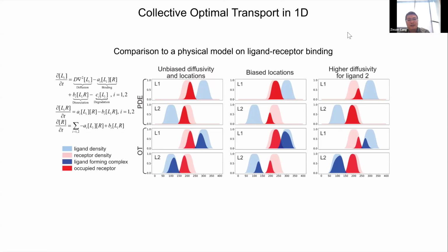In that case, a straightforward way is to use whatever decomposition methods that are out there, and then reapply. If you find 3 types in one single spot, then we can make pseudo spots at the same location, 3 spots, each representing one cell type, or even one single cell. And then this optimal transport will apply in the same way to the data.